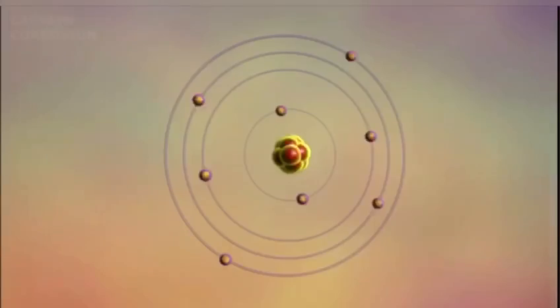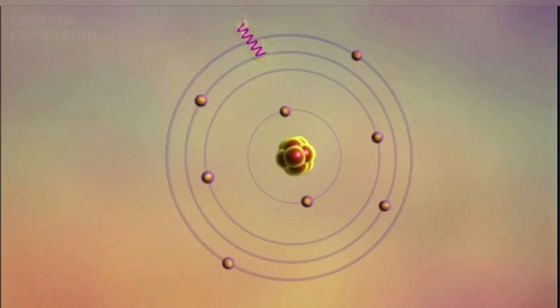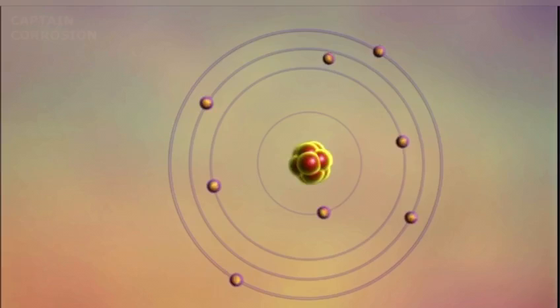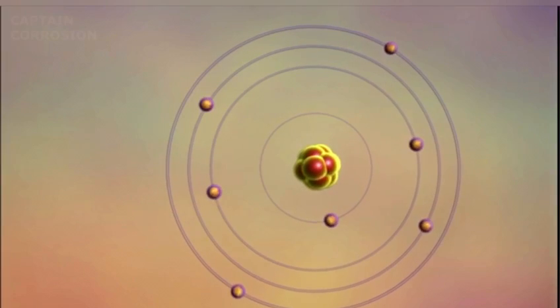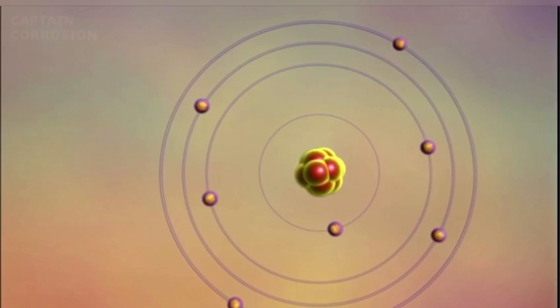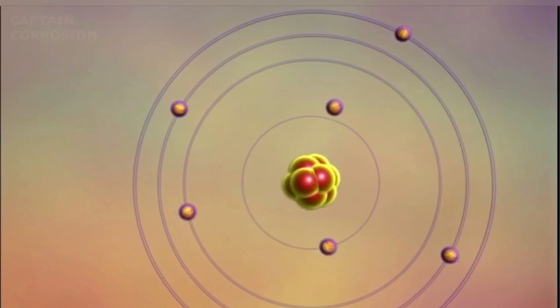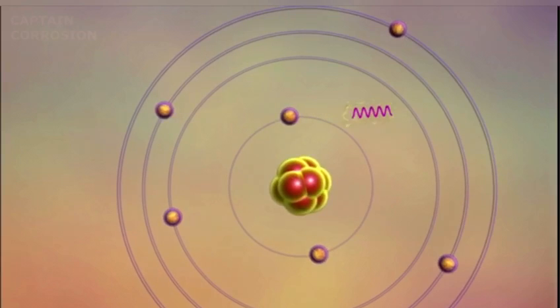Now, we want to know about how XRF works. First, a solid or liquid sample is irradiated with a high-energy X-ray from a controlled X-ray tube. An electron from one of the inner orbital shells gets kicked out from the shell. The atom regains stability by filling the vacancy left in the inner orbital shell with an electron from one of the atom's higher energy orbital shells.